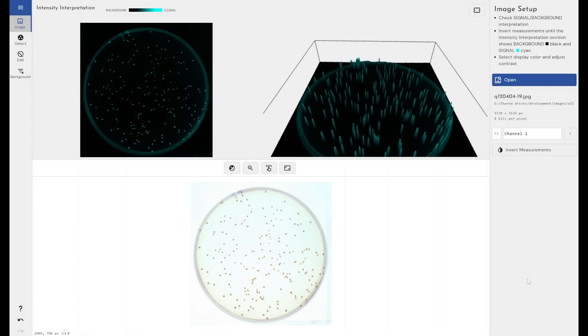There are some manufacturers out there that provide automated colony counting to reduce the burden on people within the life sciences that perform this routinely. However, they typically are part of a larger system. It's a piece of equipment that you have to buy.